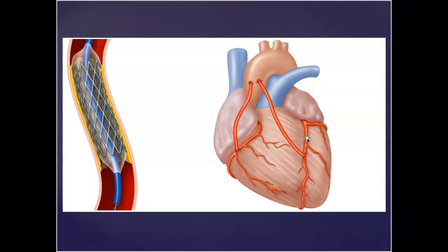It's also called a coronary occlusion, another name for that, or a heart attack is the common vernacular for I had a heart attack or an MI, myocardial infarction, or just sometimes a coronary, meaning a coronary occlusion. So one thing they can do is put a stent placement here.